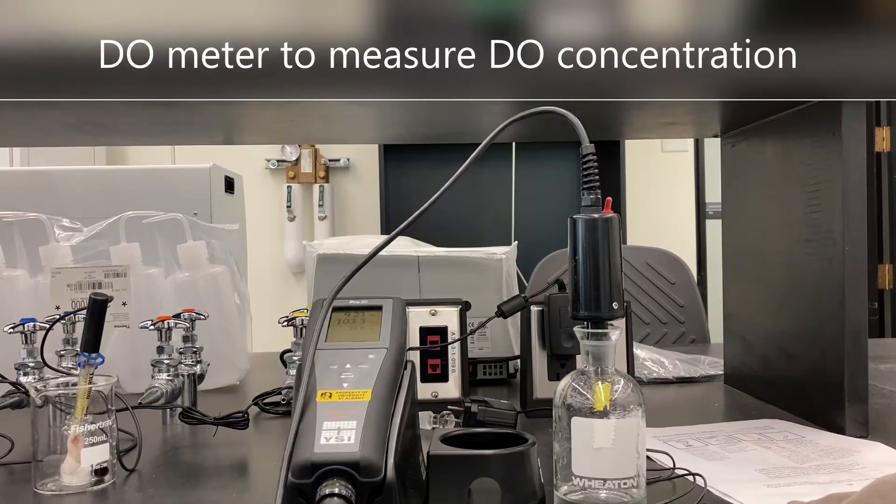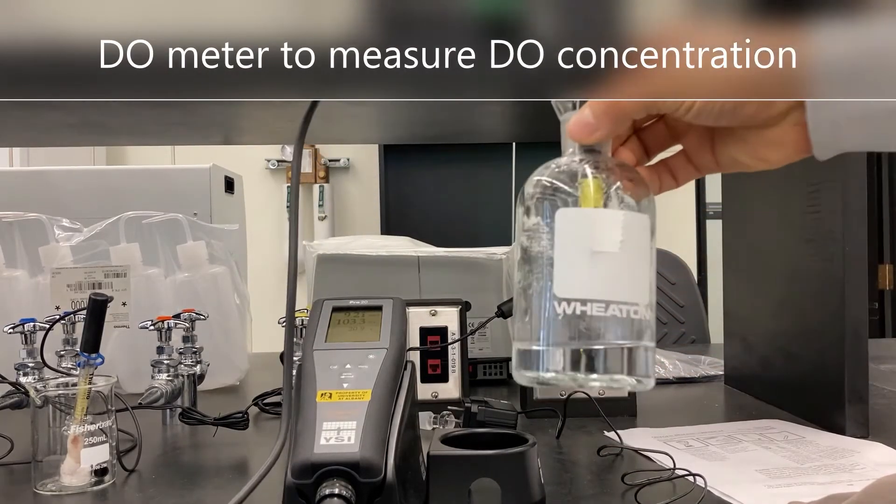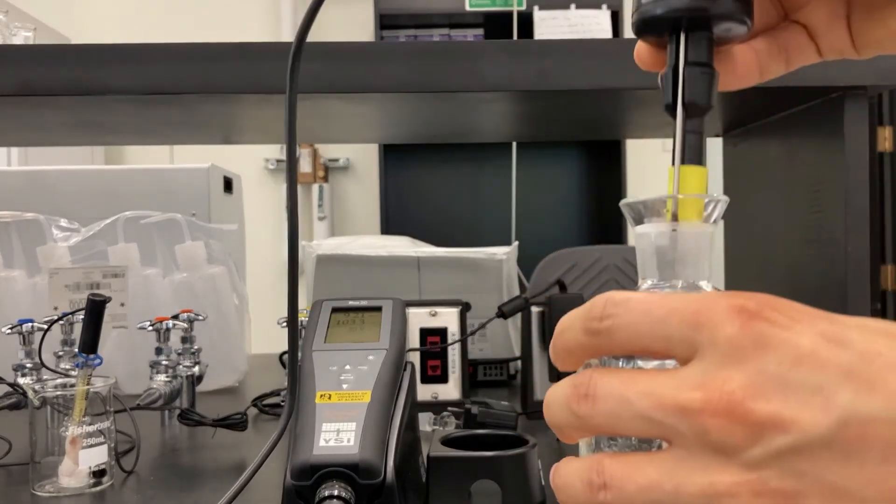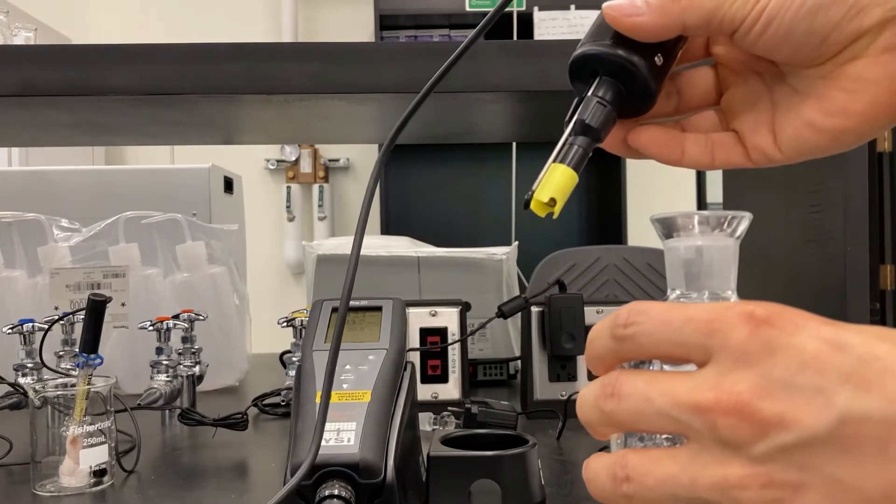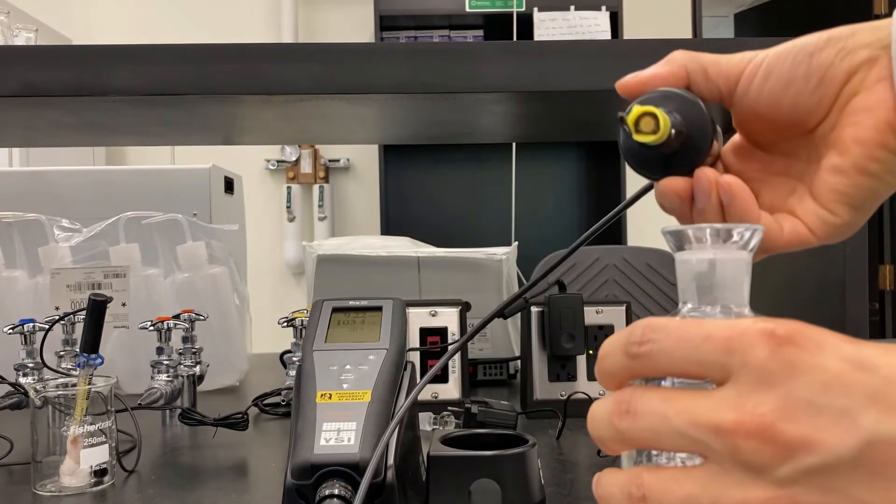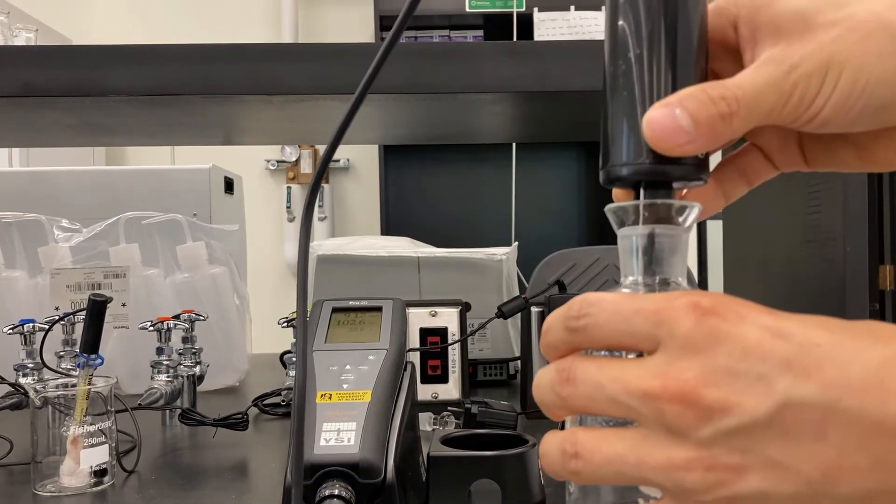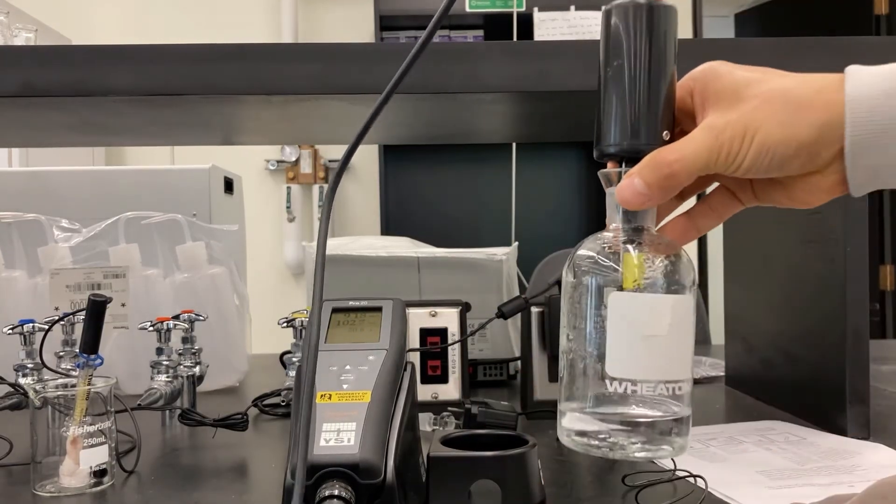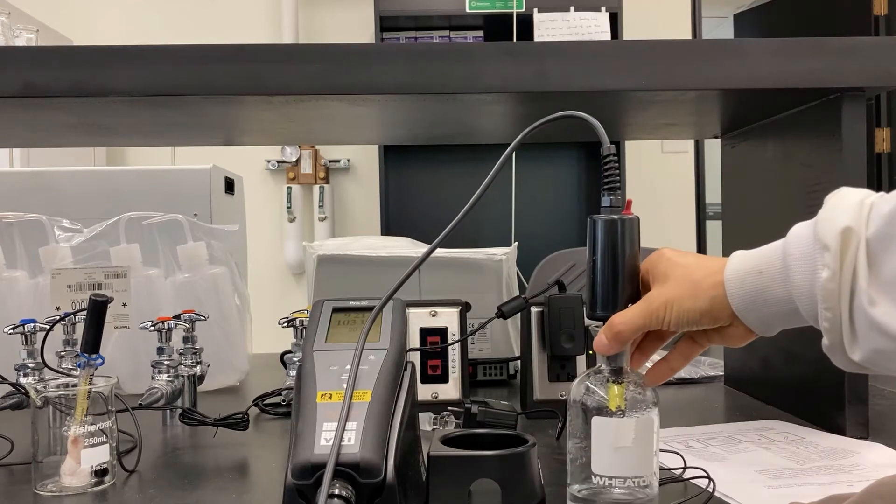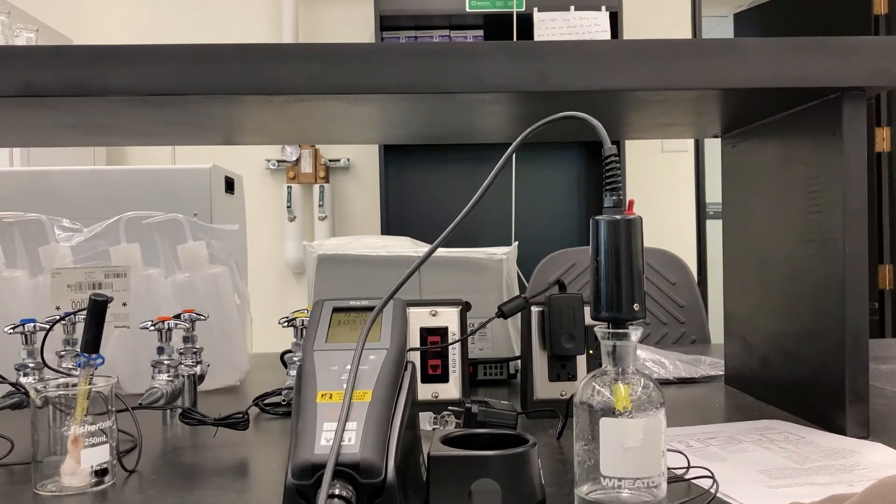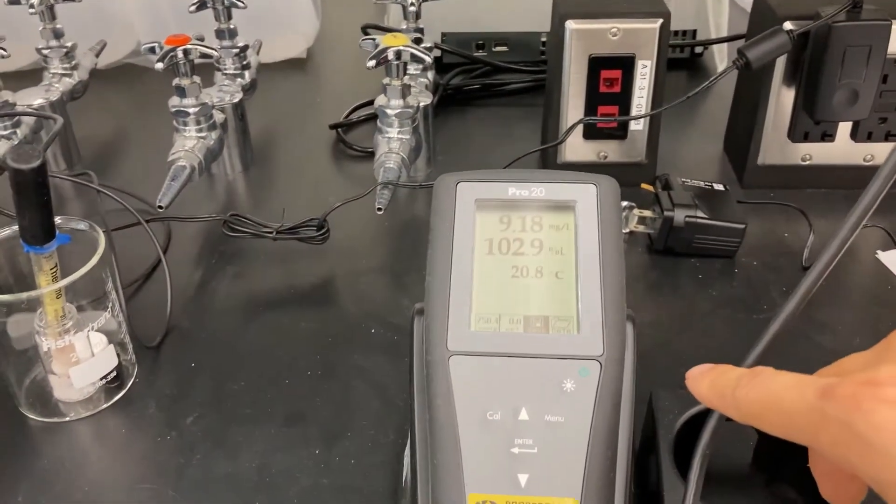This is a DO meter we are going to use to measure dissolved oxygen concentration in water. This is a DO probe, and you can put this end into the water to measure DO concentration. You can read numbers on display to check the DO concentration.